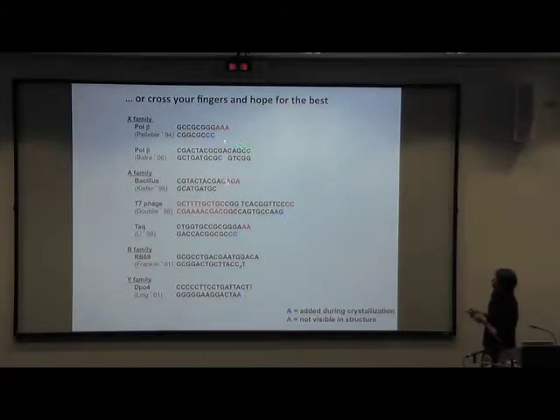And then in addition, many of the conditions added extra nucleotides, dideoxynucleotides, that would be incorporated into the crystal or before crystallization.